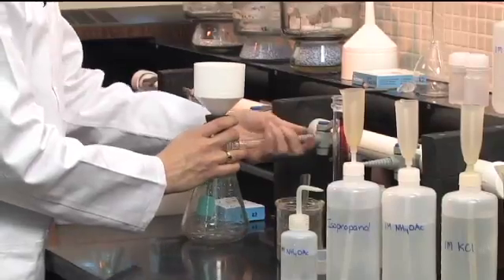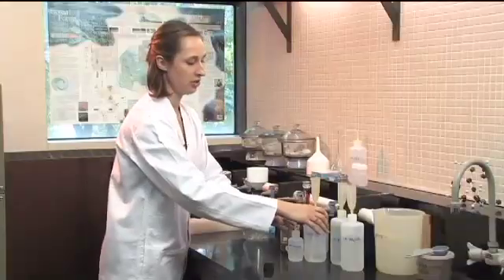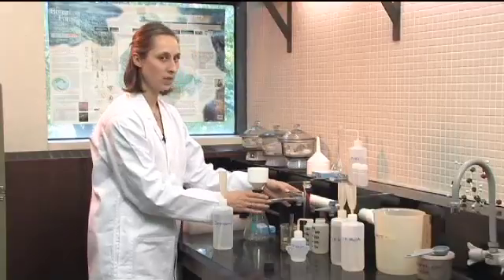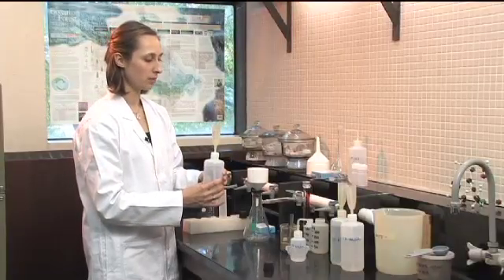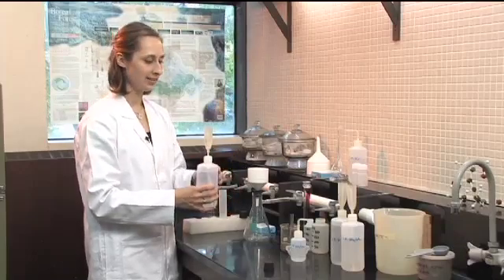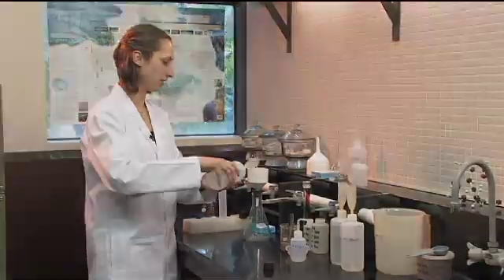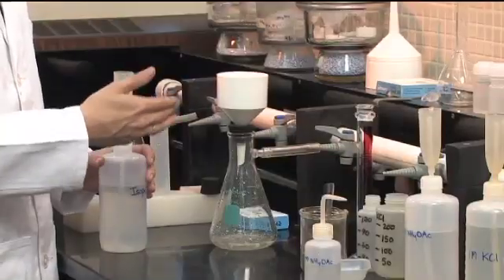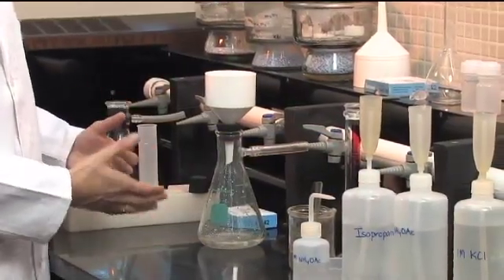Now we're ready to do our next rinse, which is with isopropanol. Turn the vacuum back on and wash with 40 ml, three times, of isopropanol. What this is doing is just rinsing out the excess ammonium that is in the soil and that isn't actually absorbed onto the exchange sites. After the three rinses, we're going to dispose of this filtrate because it's just been a rinse and we're not interested in anything that's in it.